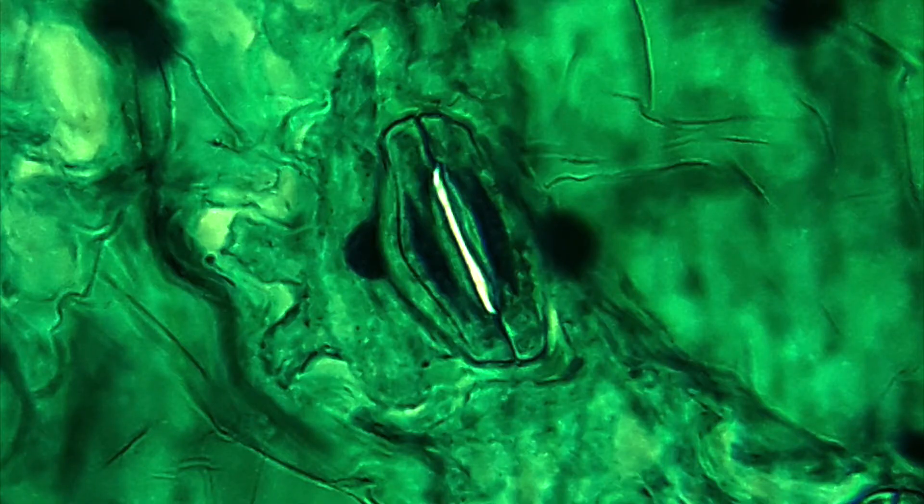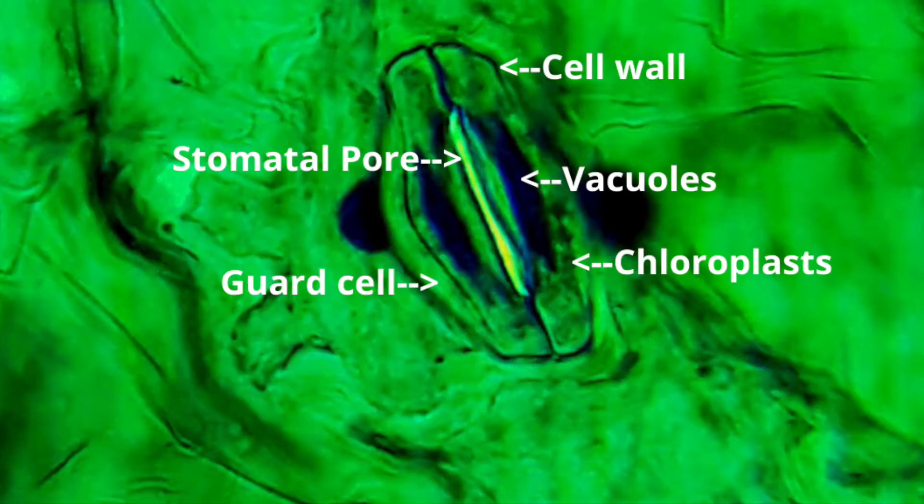Let's now look at this structure. Here's a diagram of a stoma. We can clearly see two guard cells, each of them contains a vacuole. These are the dark parts between the guard cells.